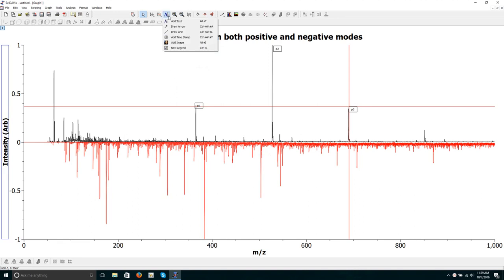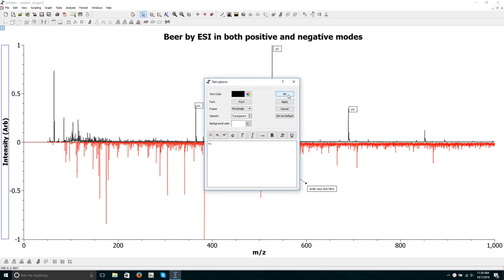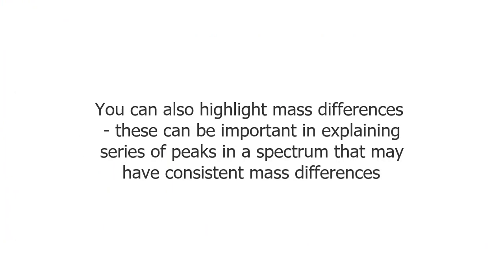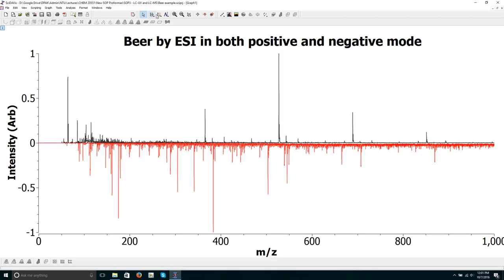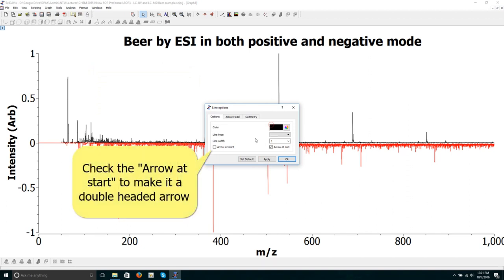Adding other shapes like arrows. This can be useful if you need to label a group of peaks that are close together. You can also highlight mass differences. These can be important in explaining a series of peaks in the spectrum that may have consistent mass differences.